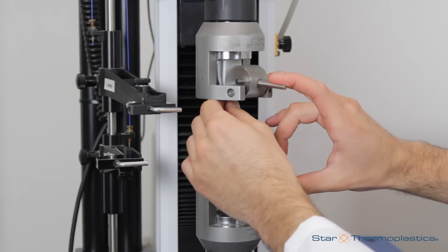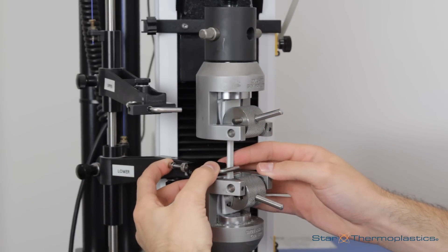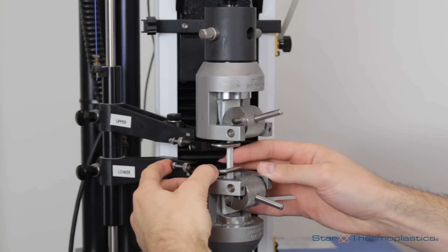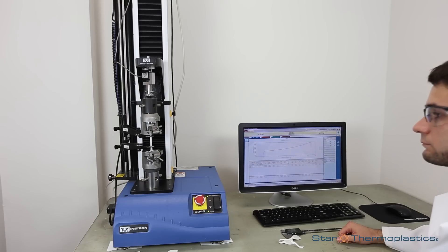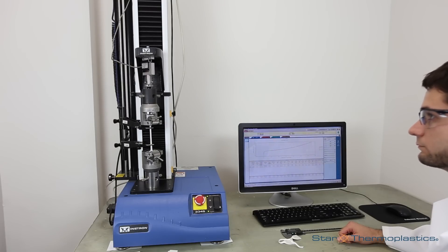The test material is secured in place with grippers, and then we initiate the test. We will set the test in motion, and as you can see, the grippers slowly begin to separate and pull the test material apart.